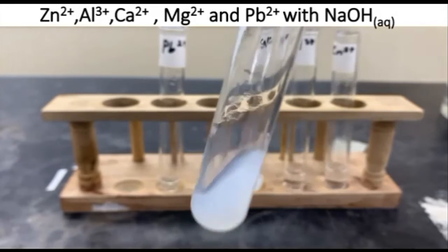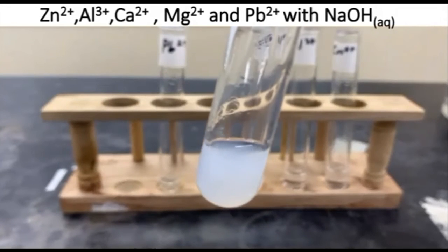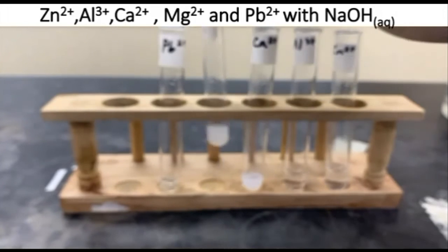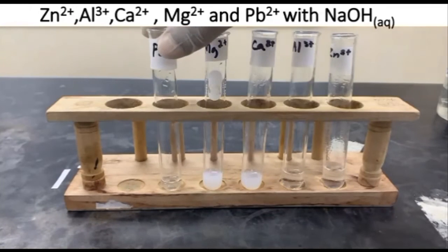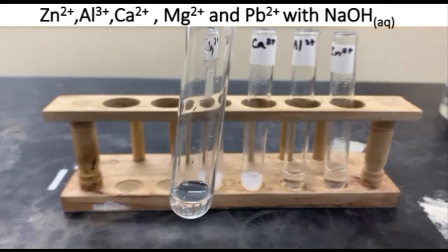And we're seeing where excess sodium hydroxide results, the precipitate is still there, did not dissolve. So far, from the four, we have two precipitates that have not dissolved.